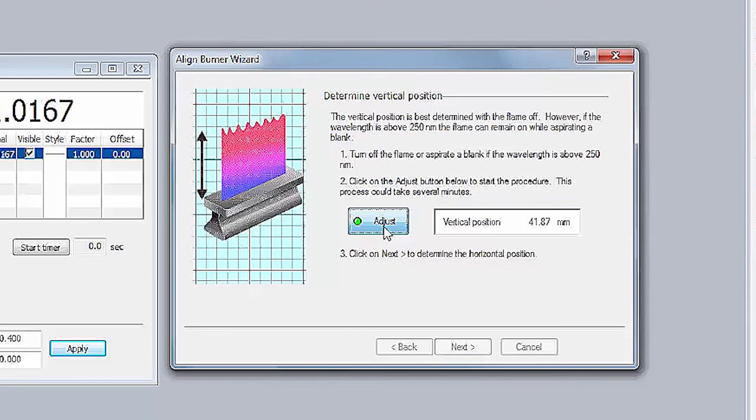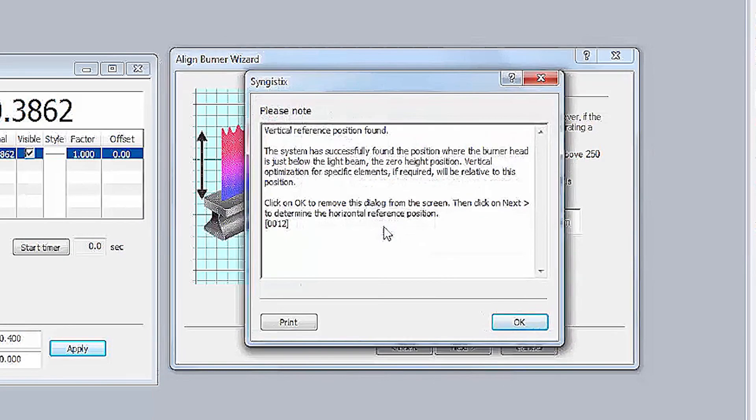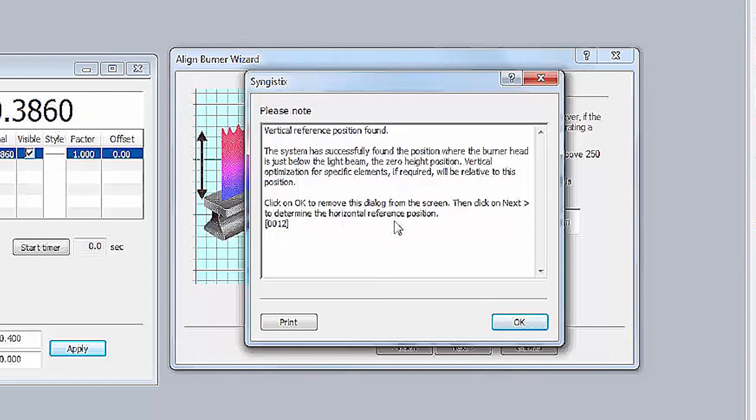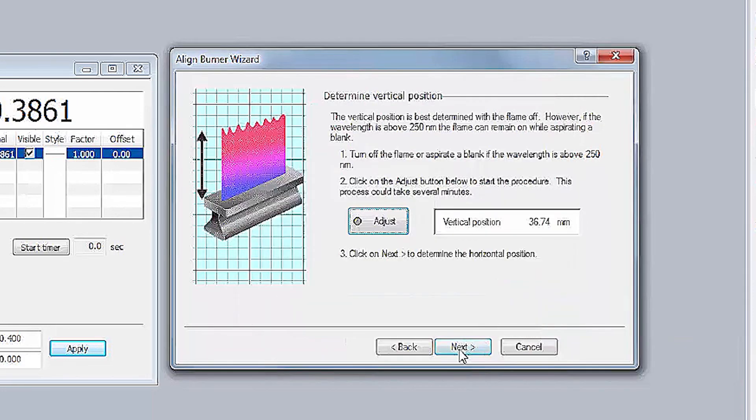Once the vertical reference point has been found, a message comes up indicating that the position has been saved. Click OK on this message. Click Next on the wizard.